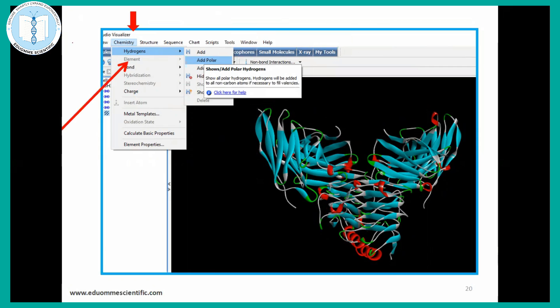And then, if you are removing the water molecule, many a time, we have to incorporate polar hydrogen also. For that purpose, you have to go to chemistry and add polar hydrogen. The overall structure will get stabilized here while doing these things.